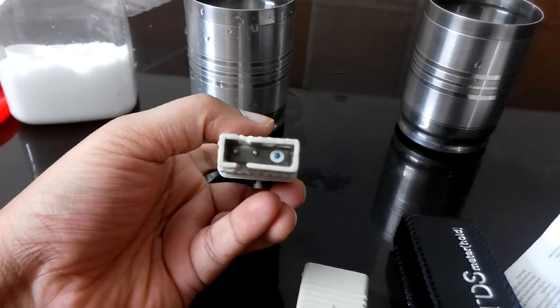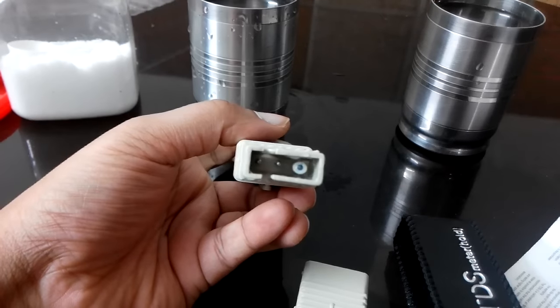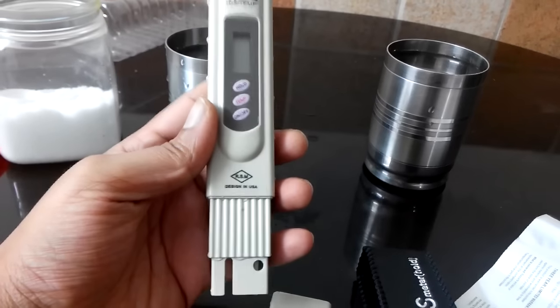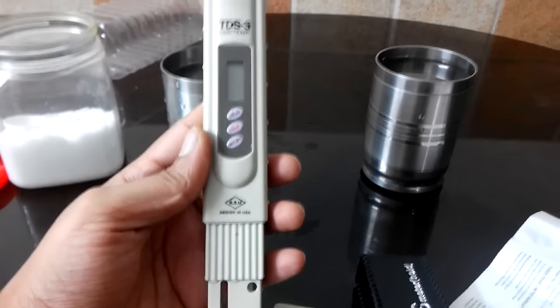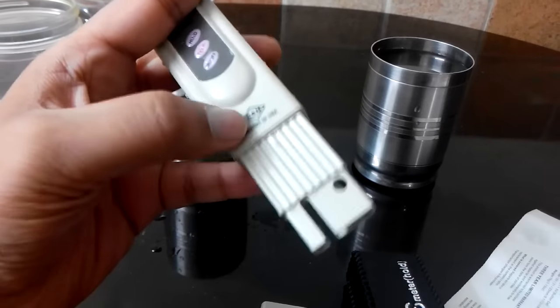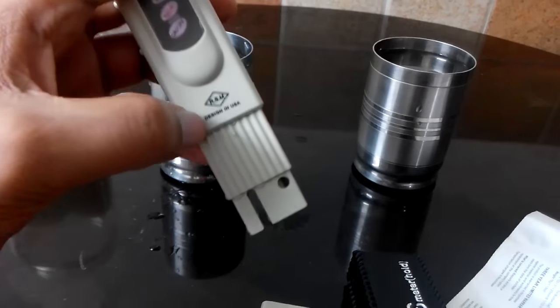If you look inside, there are two pins and one cylindrical pin — I guess that's the sensor. This is RSM design in USA, TDS-3. Basically, you can put this device in water up to the marked line.